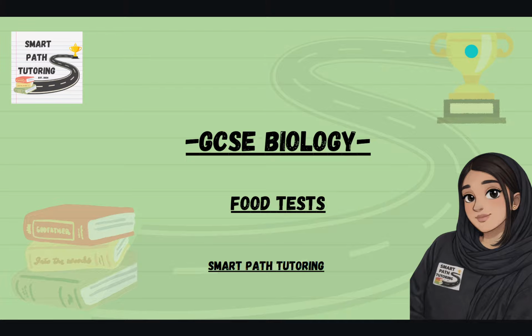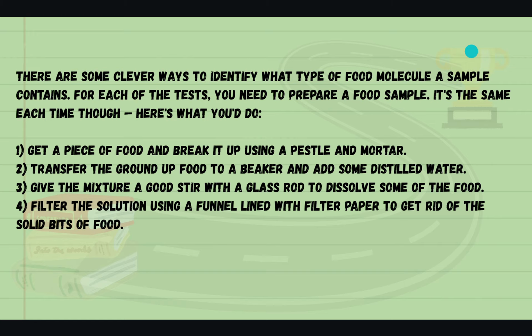In this video, we're looking at GCSE biology, focusing on food tests. So there are some clever ways to identify what type of food molecule a sample contains. For each of the tests, you need to prepare a food sample. It's the same each time though.